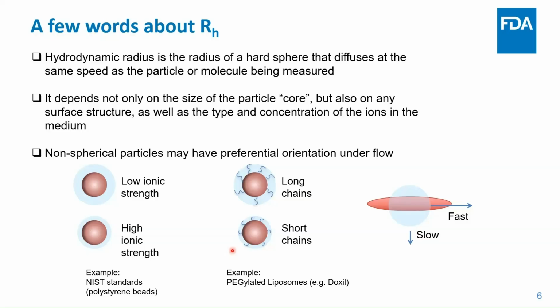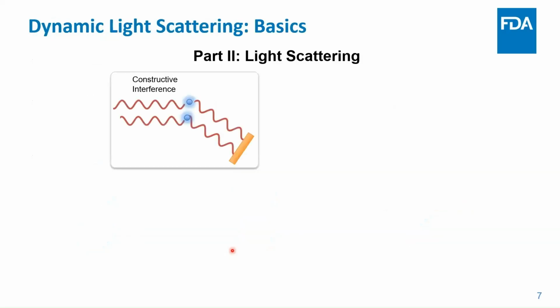So let's get into a little bit of the basic principles of dynamic light scattering. Inside a dynamic light scattering cell, either a cuvette, depending on what you're looking at, you tend to have a laser that's interrogating a small focal point inside of the cell. You have a detector that's focused at that position so that it can see any scattered light coming back from the laser source.